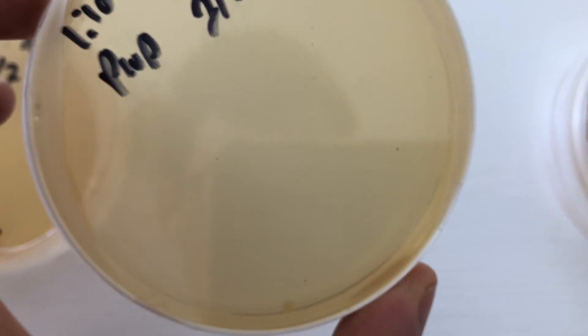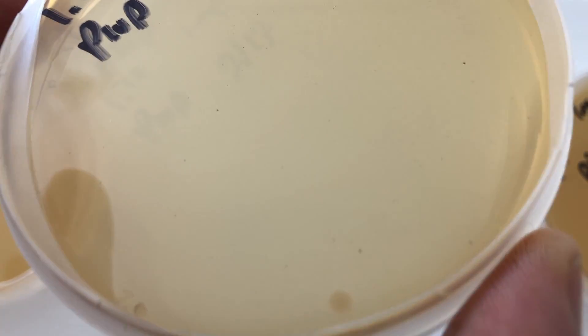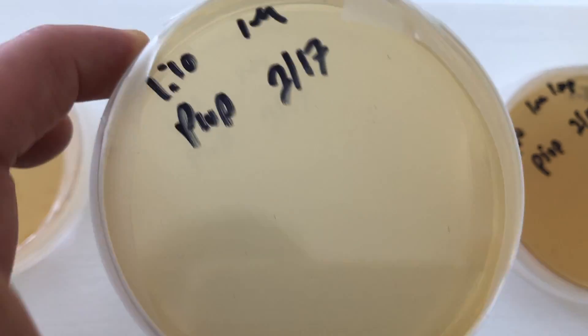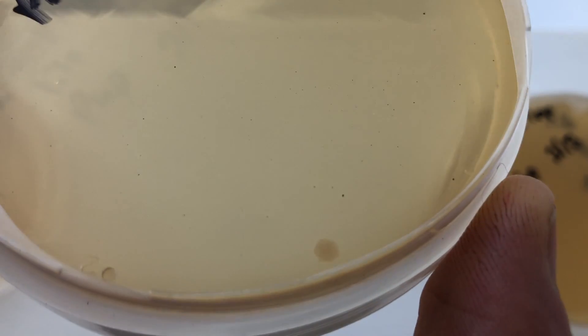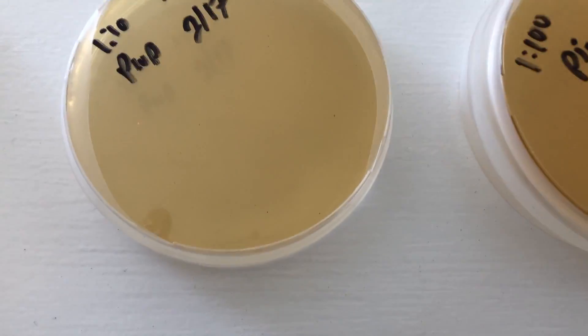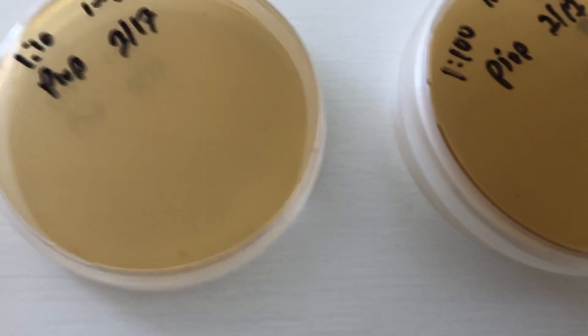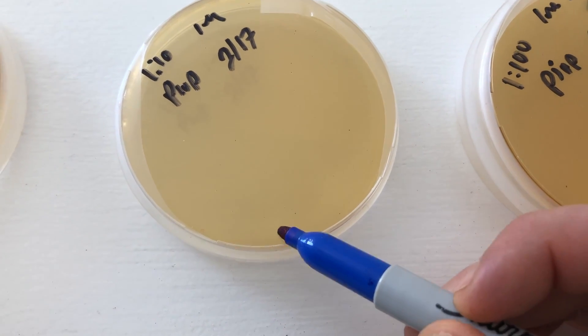This one-to-ten dilution has something going on here. I think this is also a streak plate — I did three streak plates on this — and it looks like I captured one of those bacteria that is starting to show up at 48 hours, so I'm gonna go ahead and mark that.